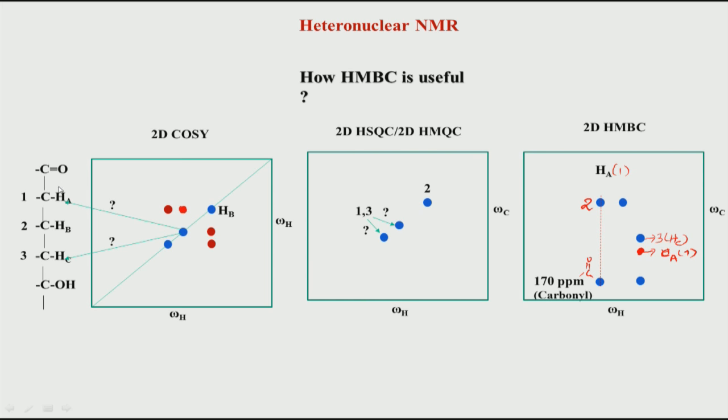So, chemical shift correlations given by 2D NMR are very useful for assignment of peaks, and remember, assignment of peaks in NMR is a very important part. It is not just recording a 1D spectrum; we cannot figure out which peak corresponds to which atom, so we need this kind of information to complete the assignment.